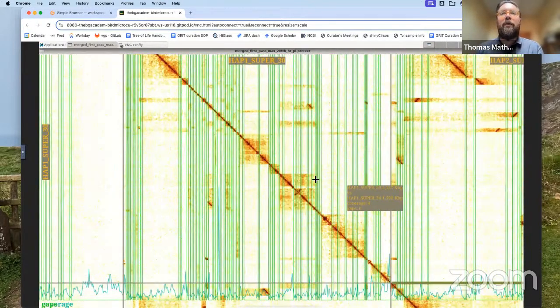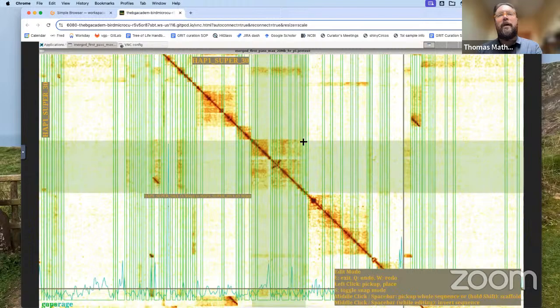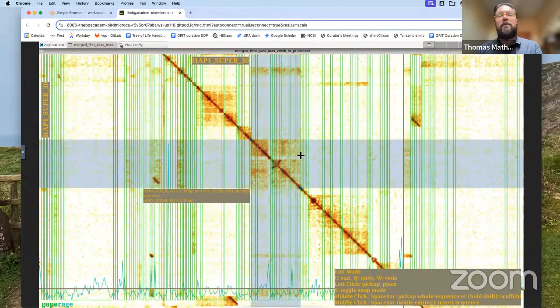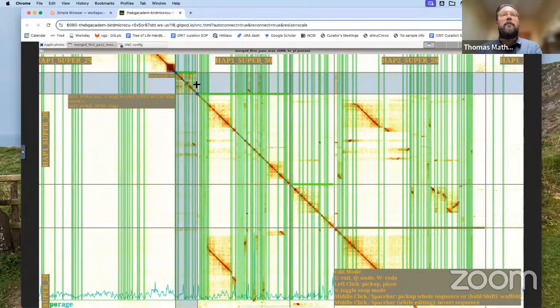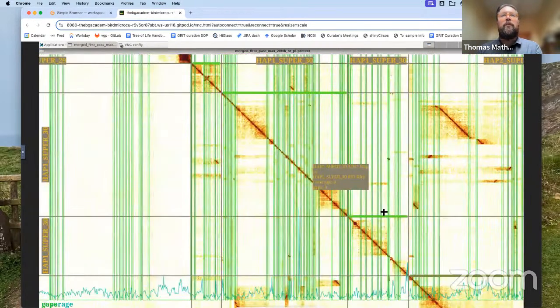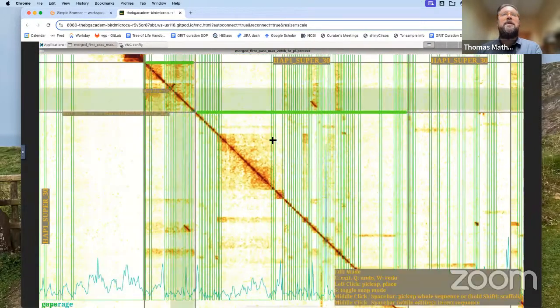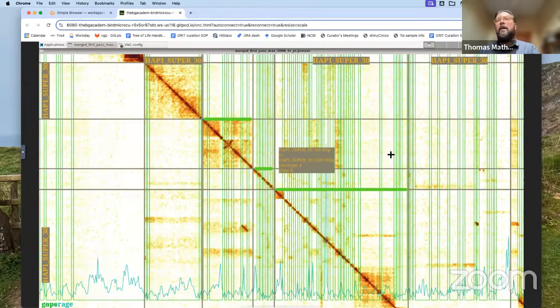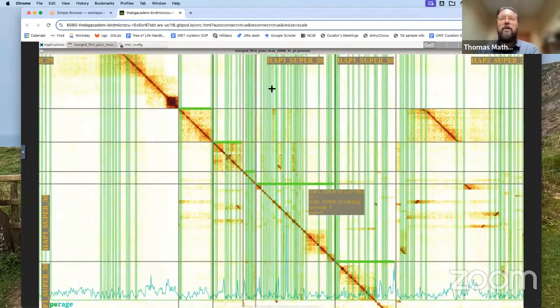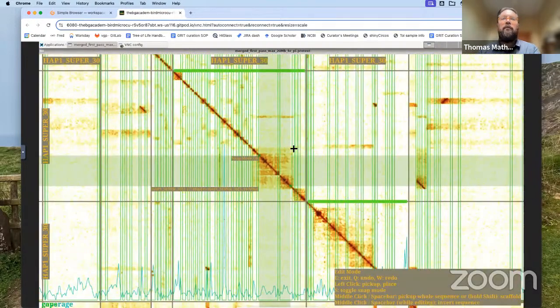What I'm going to do is break out the big chunks first. So here you can see this content here belongs together. It's got a lot of background. I'll pick this piece up, and I'll just move it to the start of the chromosome. There's another piece here which I'll split out. And because this is so jumbled up, we really need to just break it up into bits that look quite reliable, and then start adding content in to make these chromosomes. Another bit here.